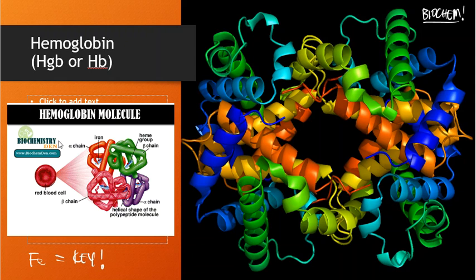We said that we're going to play off of this heme group, this iron, and some of the charges that this protein molecule could do for us in order to detect if something truly is a blood sample or not.